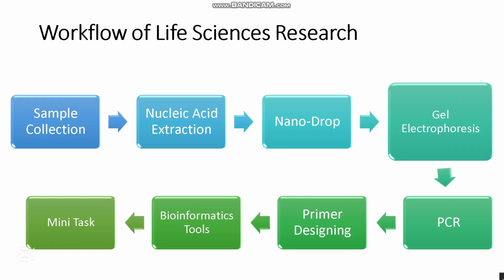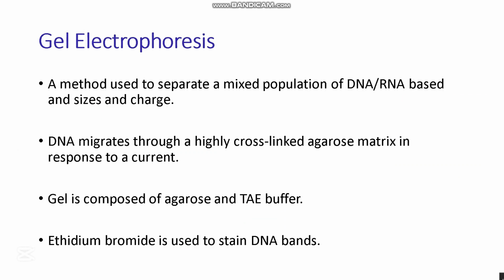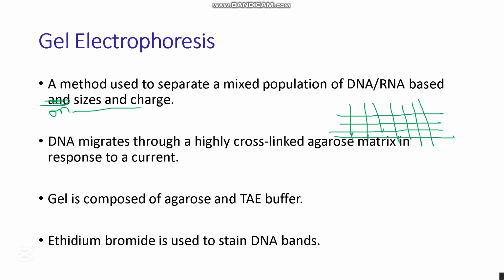So now we'll talk about gel electrophoresis. It is a method used to separate a mixed population of DNA or RNA based on sizes and charge. DNA migrates through a highly cross-linked agarose matrix. It is very closely linked, it is like that, and DNA is passed through that.